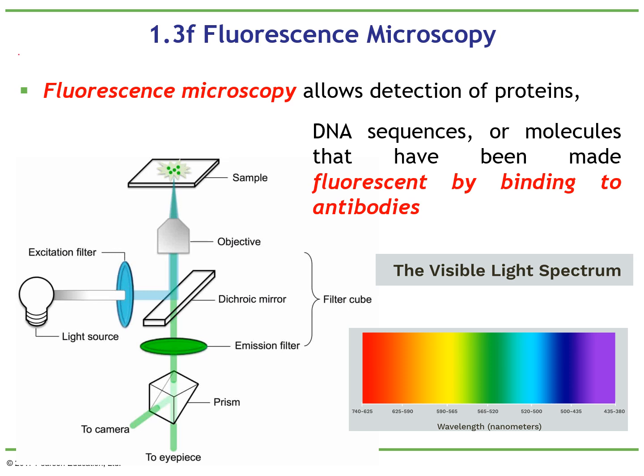So, very important. Now, the key thing to remember about fluorescent microscopy is that it allows you the detection of specific proteins. I showed you a picture, if you remember, of a cell that has the chromosomes in red and the microtubules in green. And how do we do that? Because we know that the process of microscopy allows you to have one protein that you can excite in blue, and then you can see it. It will emit a light in green, and you can see the microtubules in that way.